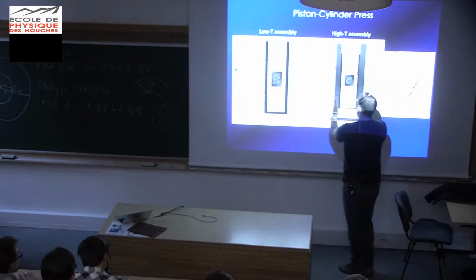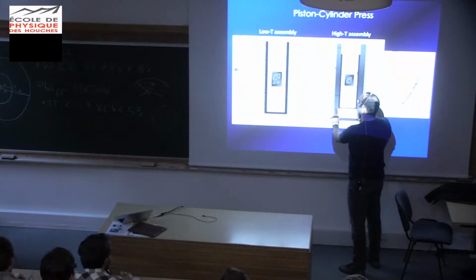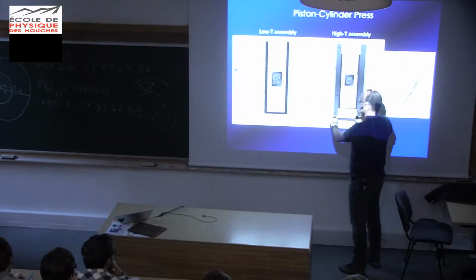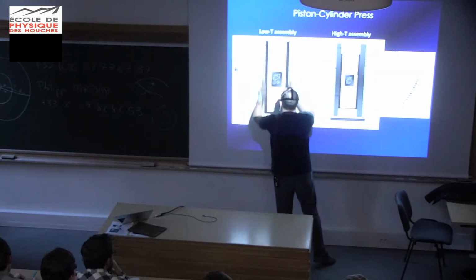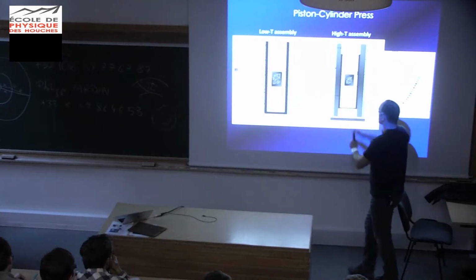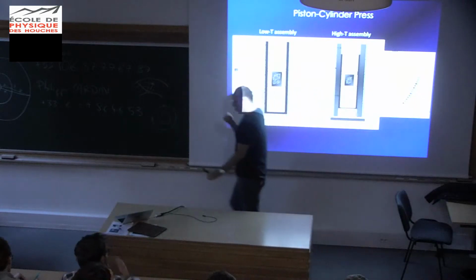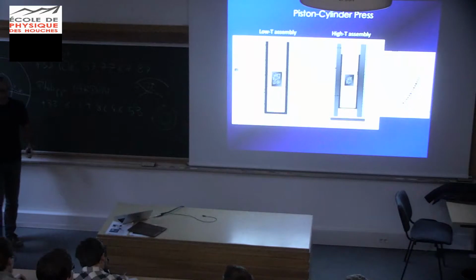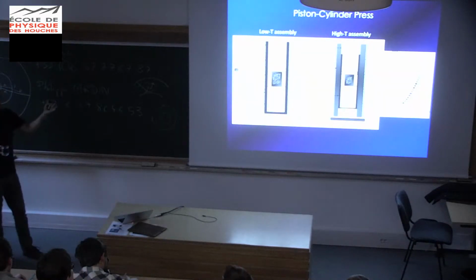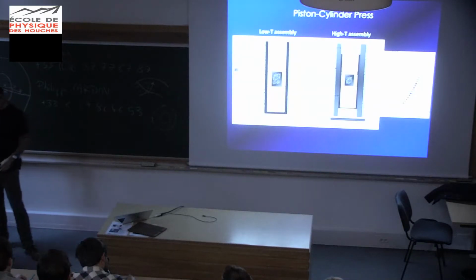And if you want higher temperatures, you do it by putting another layer of insulation, which is this lanthanum chromite disc here. So basically, this is the same as this with lanthanum chromite inserted here. And just this insulation, you can gain about 1,000 degrees. So it's not so much how much voltage and current you send through the thing, it's how much dissipation you have. And that's what you want to limit.